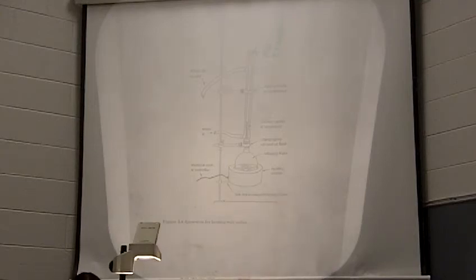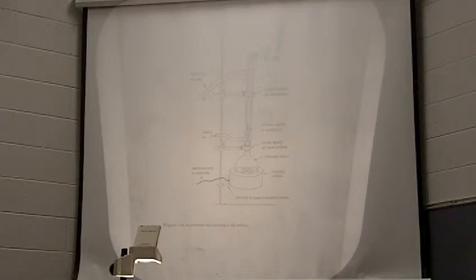Now with the heating, it's really important to note that it tells you that you need to reflux for an hour. And once it starts boiling and condensing, that is when your hour starts, okay? It's not the moment that you plug it in and turn on the heat. That's not when your hour starts. It starts when you actually start boiling and condensing, all right? So once you have been given the okay to start heating, get it plugged in, get things turned on, and then keep an eye on it and make sure you start seeing signs of it heating and progressing. You don't want it to sit there for a while with nothing happening just because you don't have the ohmite turned up enough or you forgot to turn the switch on, because that is part of your heating time that's not happening, all right?